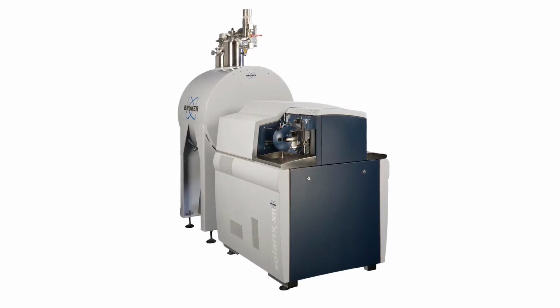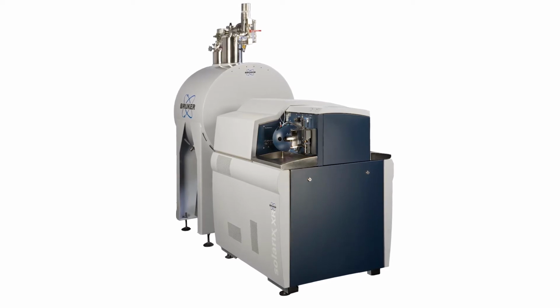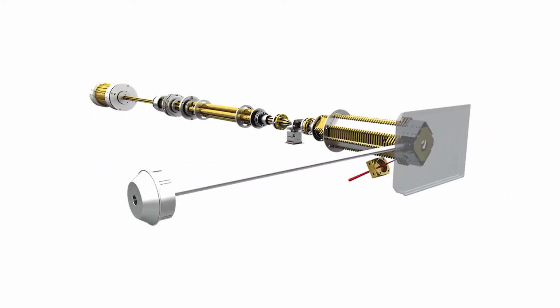So one of the unique advantages of MALDI molecular imaging, again, is that we can do de novo identification on the basis of accurate mass. There's no front-end separation step required. This is different from many analyses because our selectivity comes from extremely high mass resolving power or from unique mass measurements. Another unique feature, particularly of the Bruker instruments, is that the tissue itself is not destroyed during the analysis.